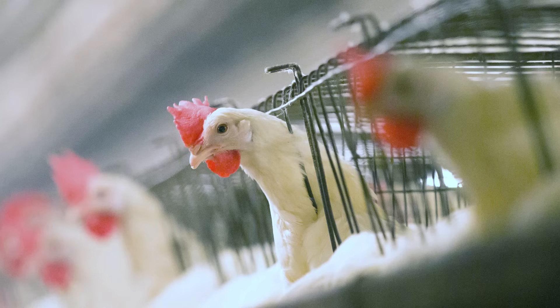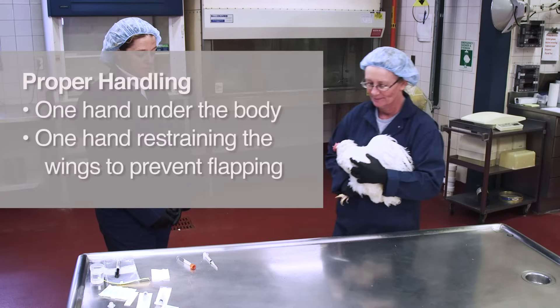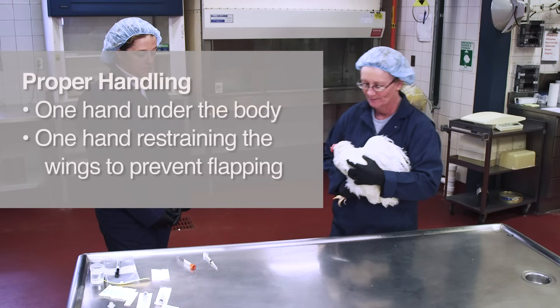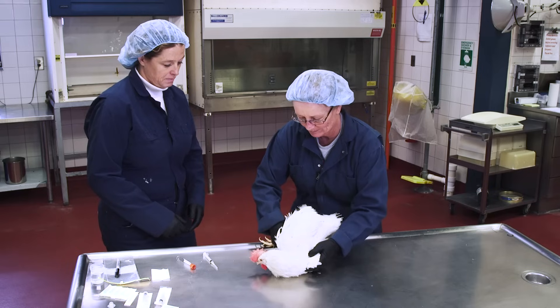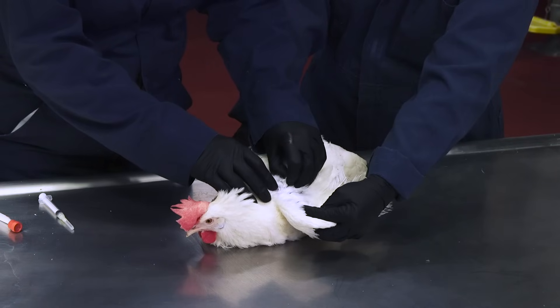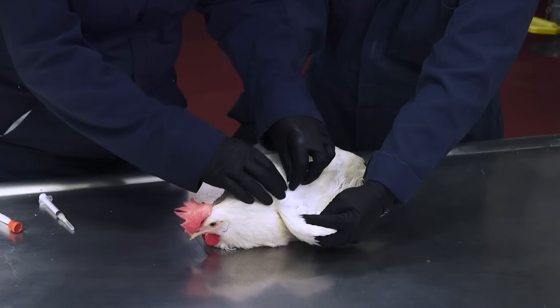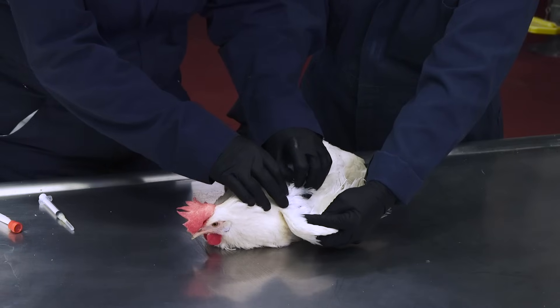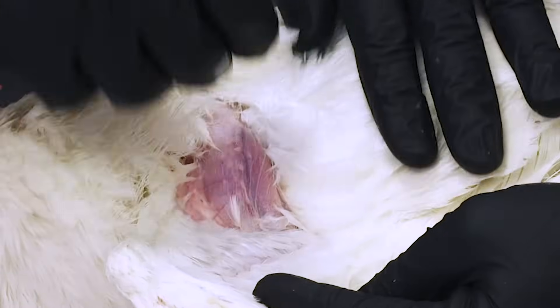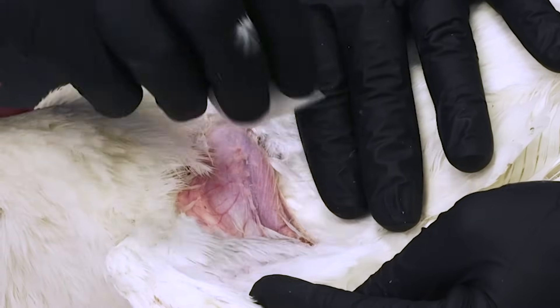We'll demonstrate the two-person technique with a laying hen. When using a table, one person will pick up the bird using one hand under the body and one hand gently restraining the wings to keep the bird from flapping. Lay the bird on its side, keeping the legs restrained, then gently lift up the wing. You may need to pluck a few feathers to get a clear view of the brachial vein — pluck the feathers at the base gently, quickly and firmly, pulling in the direction of growth. If you need to sanitize the area, you can use an alcohol wipe, which also helps make the vein stand out.